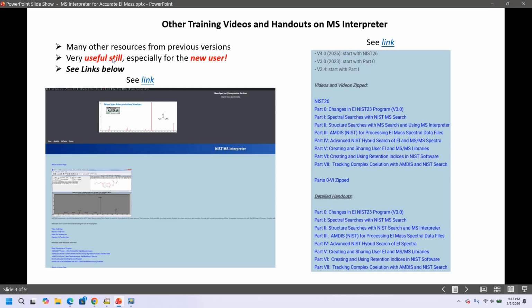They're still very useful, especially for the new users, and you can see some of the links below. This one's particularly good here, but even in my course on the general use of the software within the NIST software from previous versions, you'll see that it has MS Interpreter sessions plus many other useful resources, but it's split into videos and associated handouts.